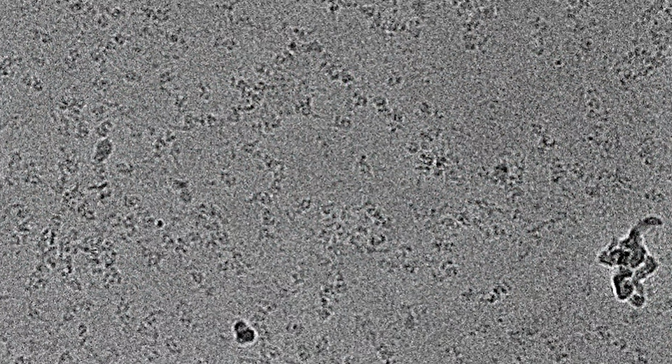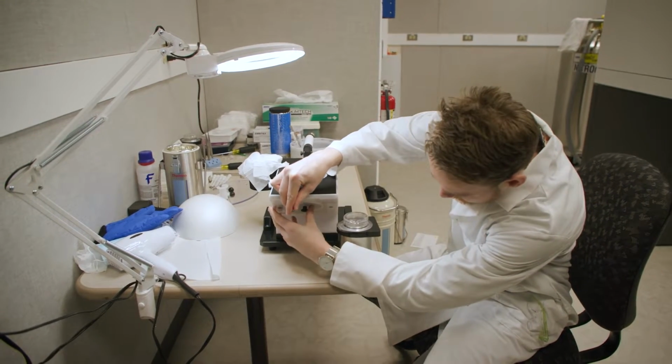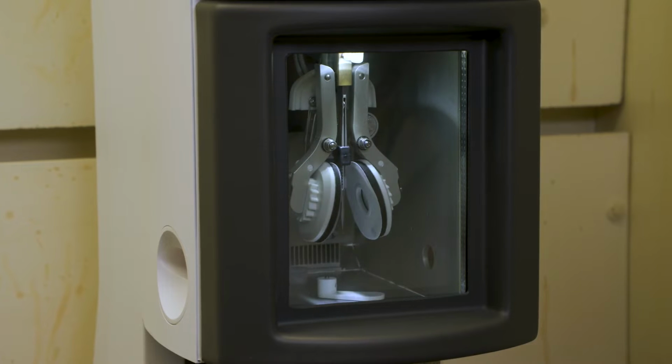Cryo-electron microscopy, or cryo-EM, is a technique that's used by structural biologists to solve structures of macromolecules. What is exciting to me about cryo-EM is how it's bringing in all these different people from different labs and different research programs to work on similar types of questions using a similar technology. I have been amazed by the power of cryo-EM in solving quite a few difficult structures of the wave complex, showing how it is activated.